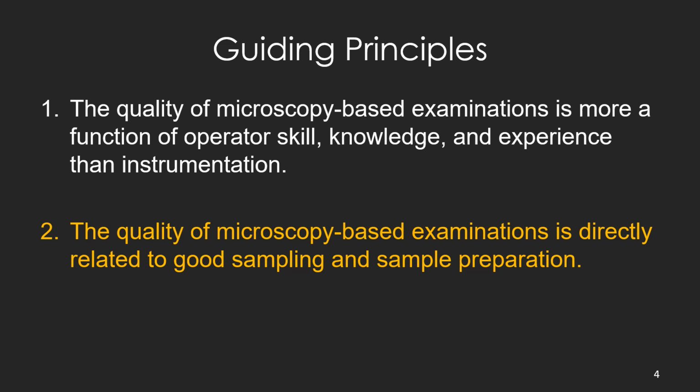Once again, the guiding principles are that success in contaminant identification is very much related to your skill as an analyst, as a user of the microscope. Now, you can begin to get that skill in a lot of different ways: watching videos, reading books, going to meetings and listening to people talk about the subject.